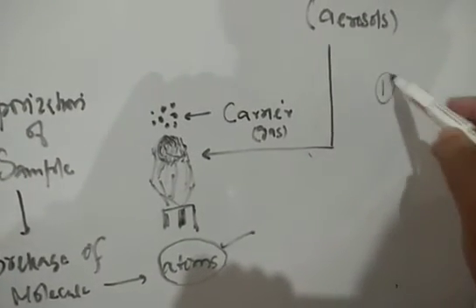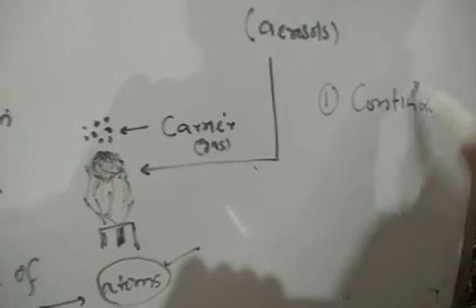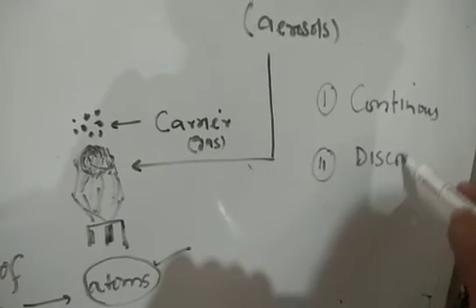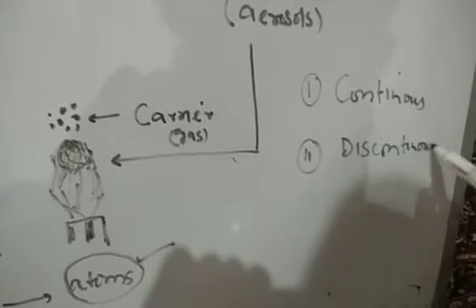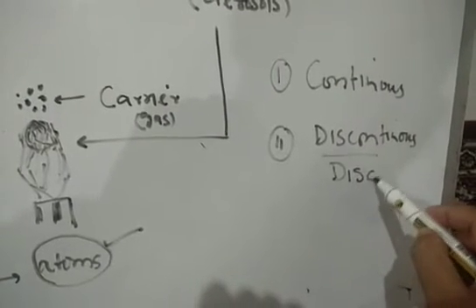Now अब ये जो process है, ये प्रोसेस ऑफ एटोमाइजेशन कैन बी ऑफ टू टाइप्स. वन इज इट कैन बी अ कंटिन्यूअस प्रोसेस और इट कैन बी डिसकंटिन्यूअस. Now what do we mean by the continuous and discontinuous atomization process? Discontinuous is also called as a discrete. It's also called as discrete process. So atomization can be continuous or atomization can be discrete.